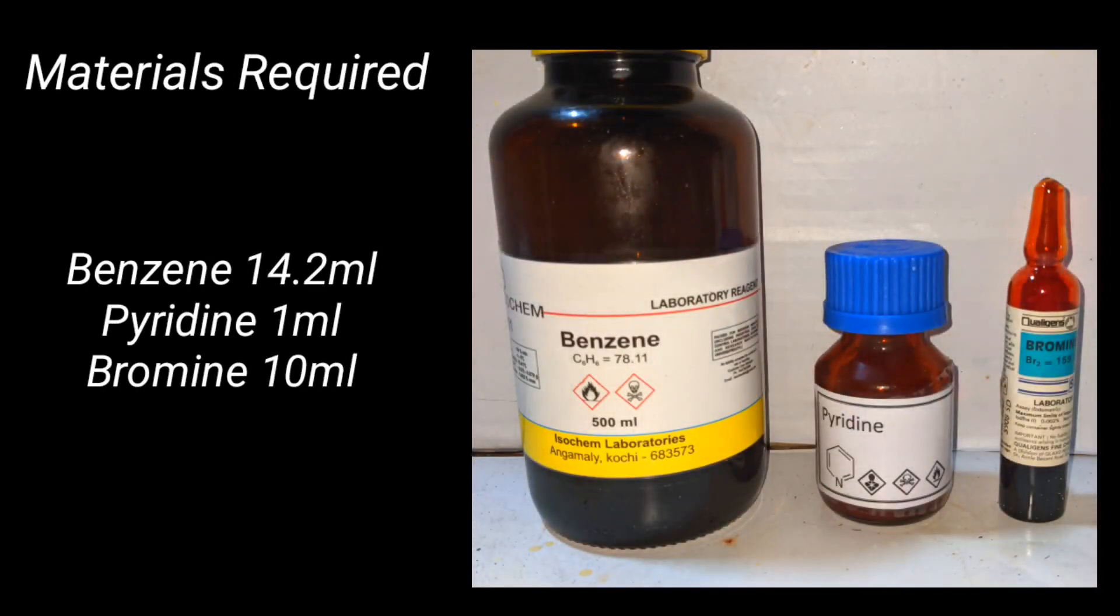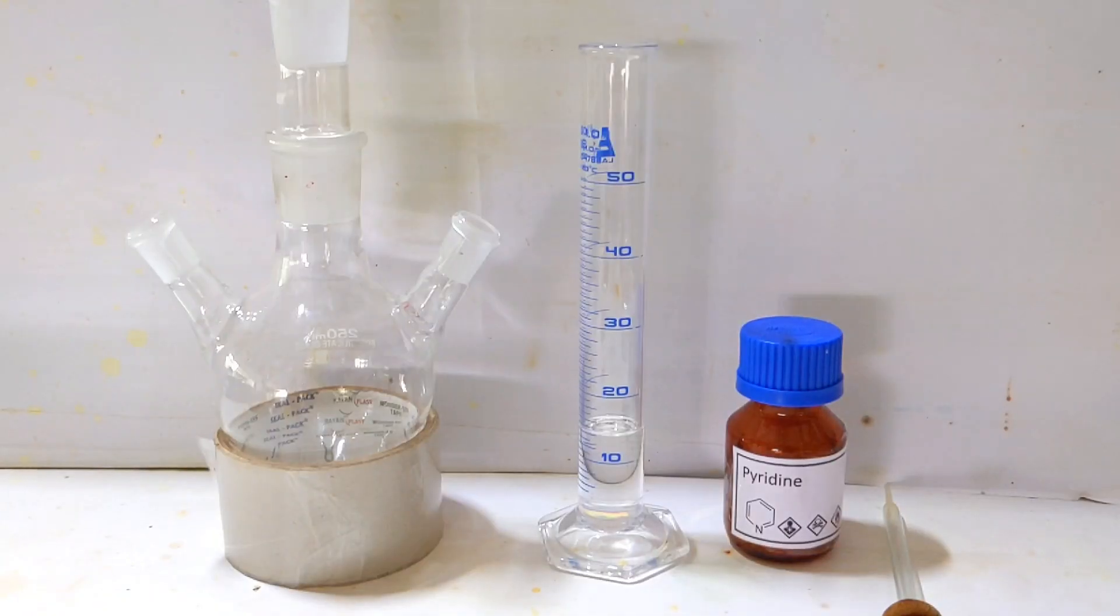Materials required for this preparation include 14.2 ml of benzene, 1 ml of pyridine, and 10 ml of bromine.